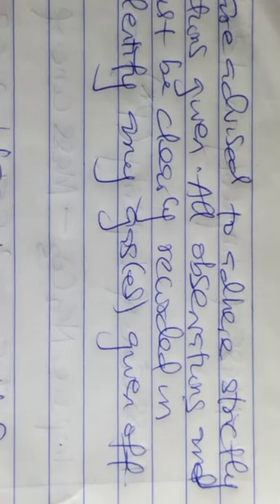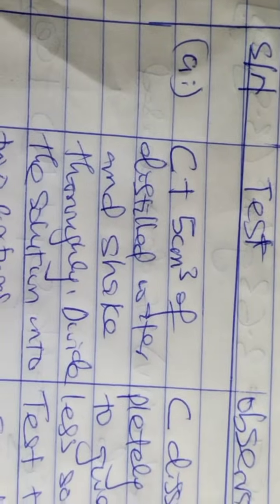Identify any gas or gases given off. So let's go straight to the question. So in the question, the tests were written for the students. Then you do the test according to the instruction written for you. Then all you have to do is fill in the observation and the inference.